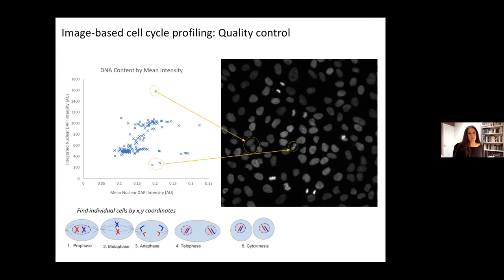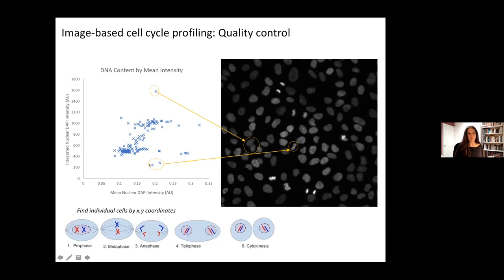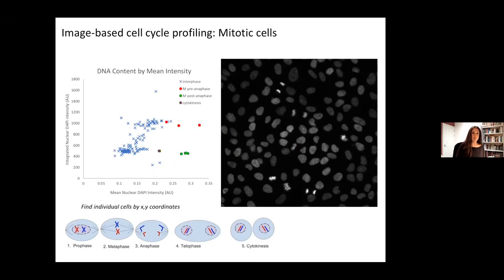Looking at a micrograph of cells stained with DAPI to label the DNA, each point corresponds to one cell in the image. We plot the integrated DNA — the sum of all pixel intensities — as a function of average pixel intensity. You can see the G1 peak for cells with one copy of the genome, about two times the integrated intensity for cells in G2, and a bunch of cells in the middle in S phase. We can also identify missegmented cells — two cells stuck together with four times as much DNA, or one cell accidentally split in two — making these plots useful for quality control.